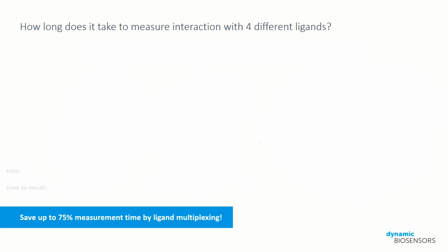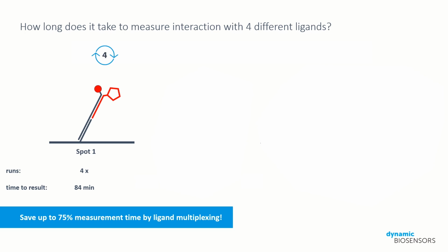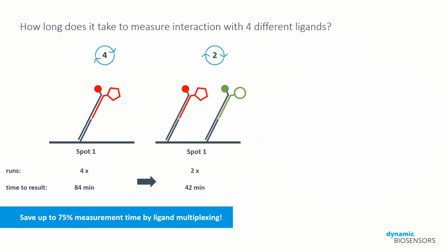Let us show you the advantage of multiplexing by going through a calculation of runtime. Based on the interaction settings for the tutorial, measuring the interaction of an analyte with 4 different ligands sequentially would take about 84 minutes. Not too bad, but this time can be reduced by half by functionalizing measurement spot 1 with 2 color-coded ligands simultaneously.